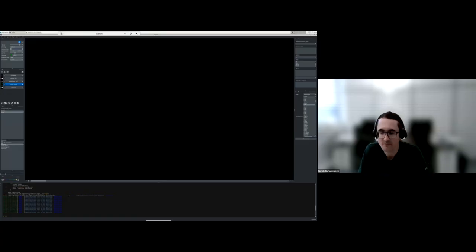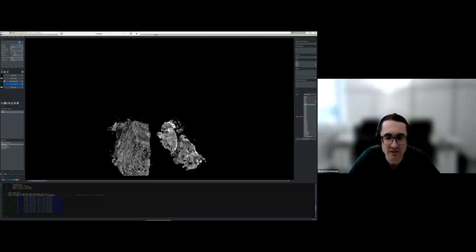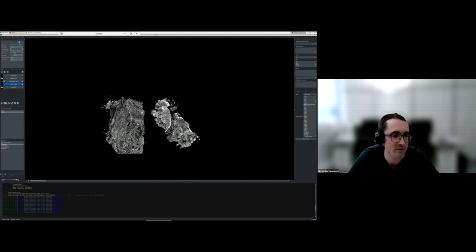And okay, so here now we can start viewing things. Here I have already opened the object to save us some time. So here is our Xenium image. This is just the DAPI for our two samples. But of course, we want to see a bit more. So we can add on top our labels, our cell segmentation, and of course we can choose what we want to color it by.